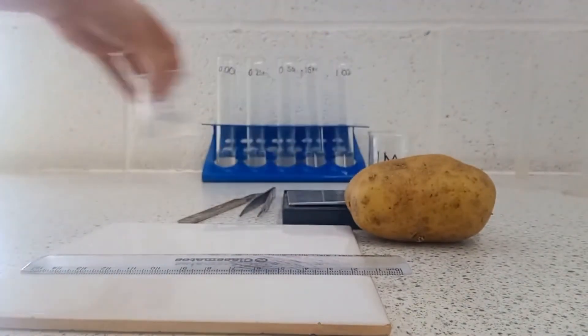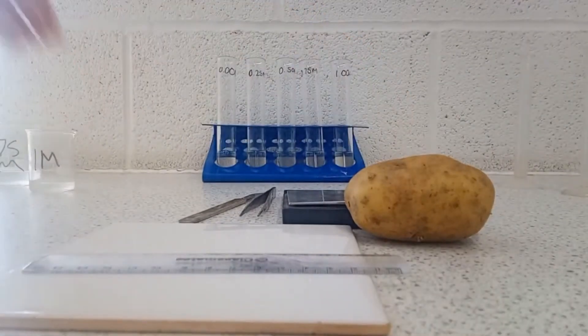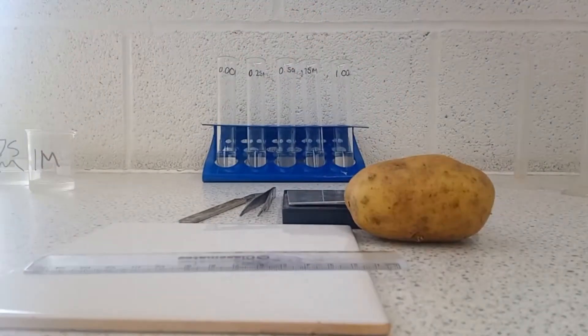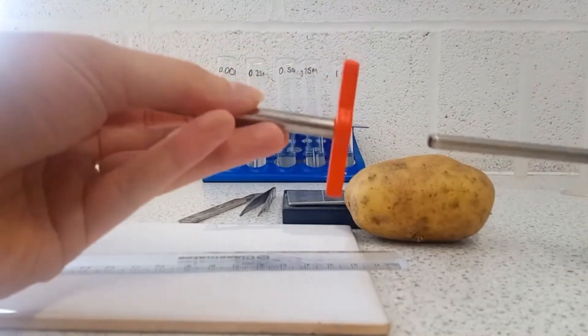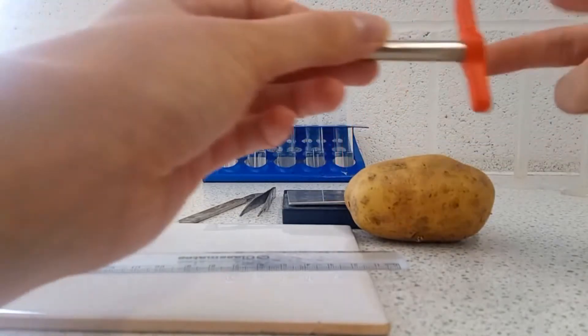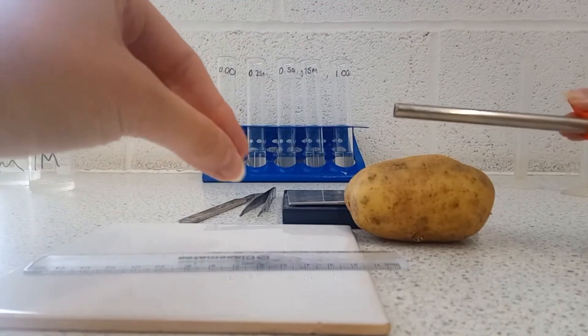In order to ensure that I have pieces that are as similar sized as possible, I use this piece of equipment called a cork borer, and I insert this into the potato, and this will help me to cut pieces that have a consistent diameter.